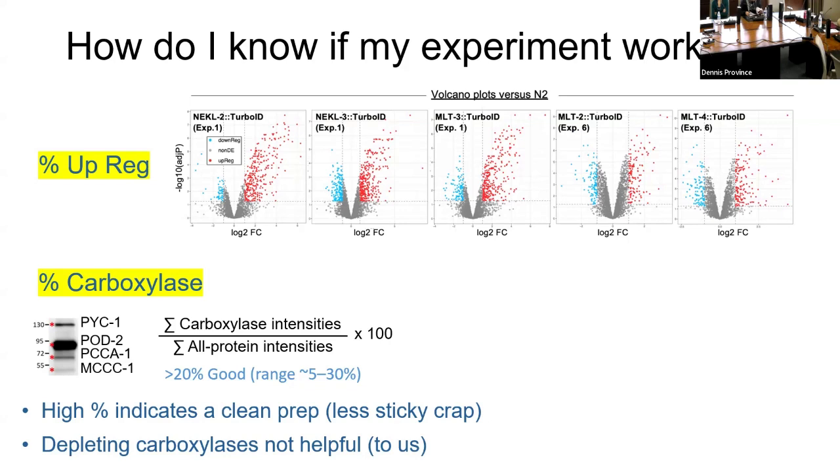But the ways to do it aren't that straightforward, and involve putting tags on all of them and sort of pre-clearing them from the lysate. And then you're introducing more steps and things degrade. I don't think it's worth it. All right, that's my opinion.